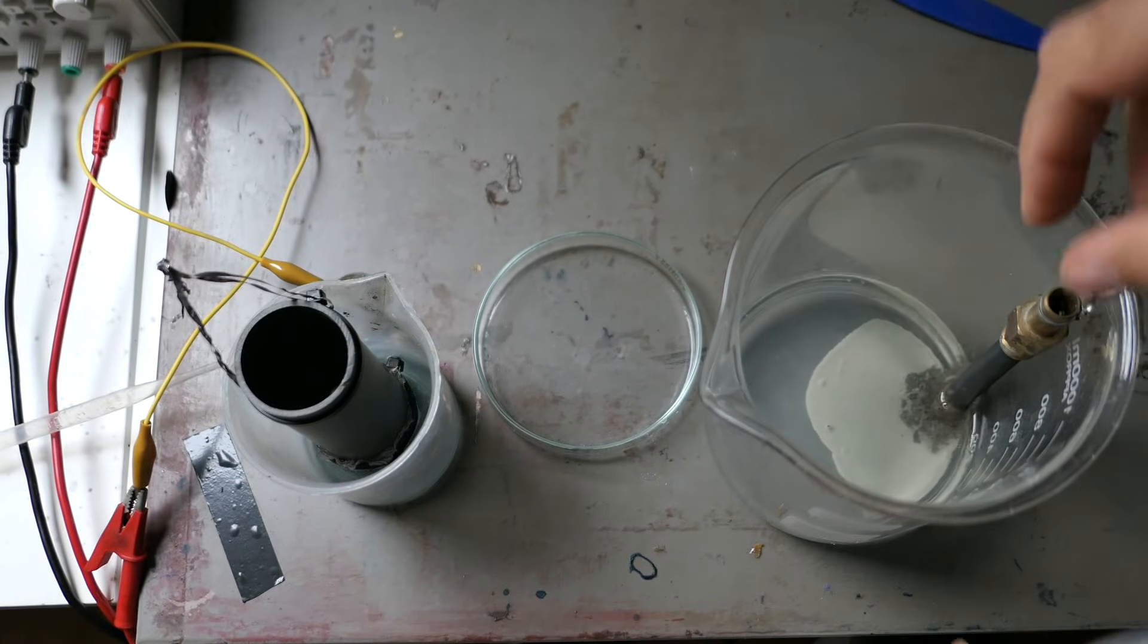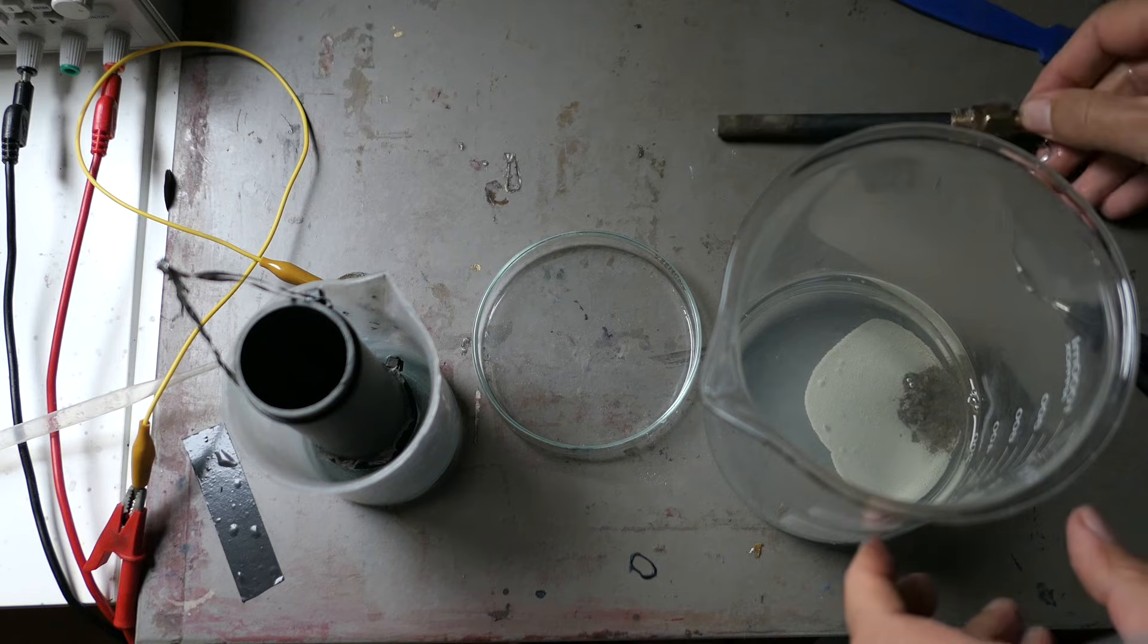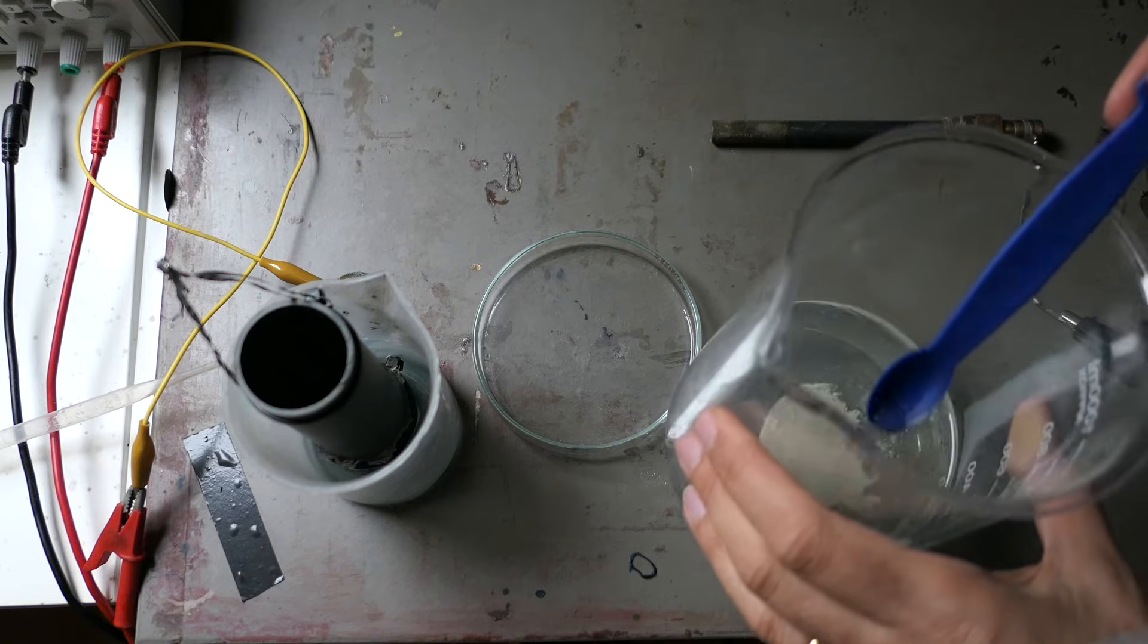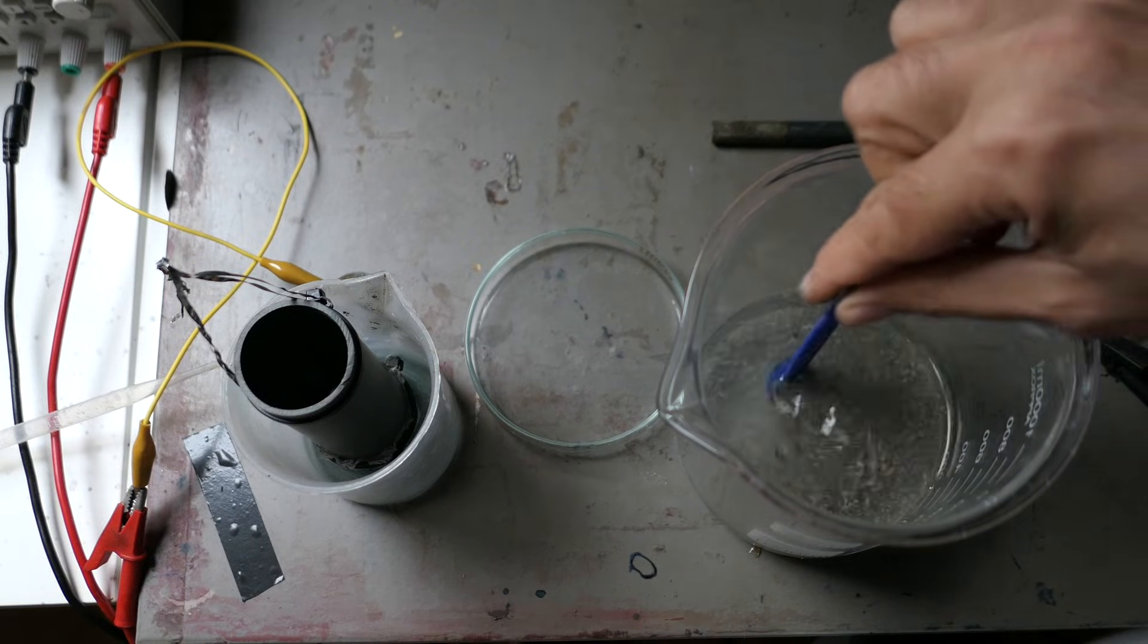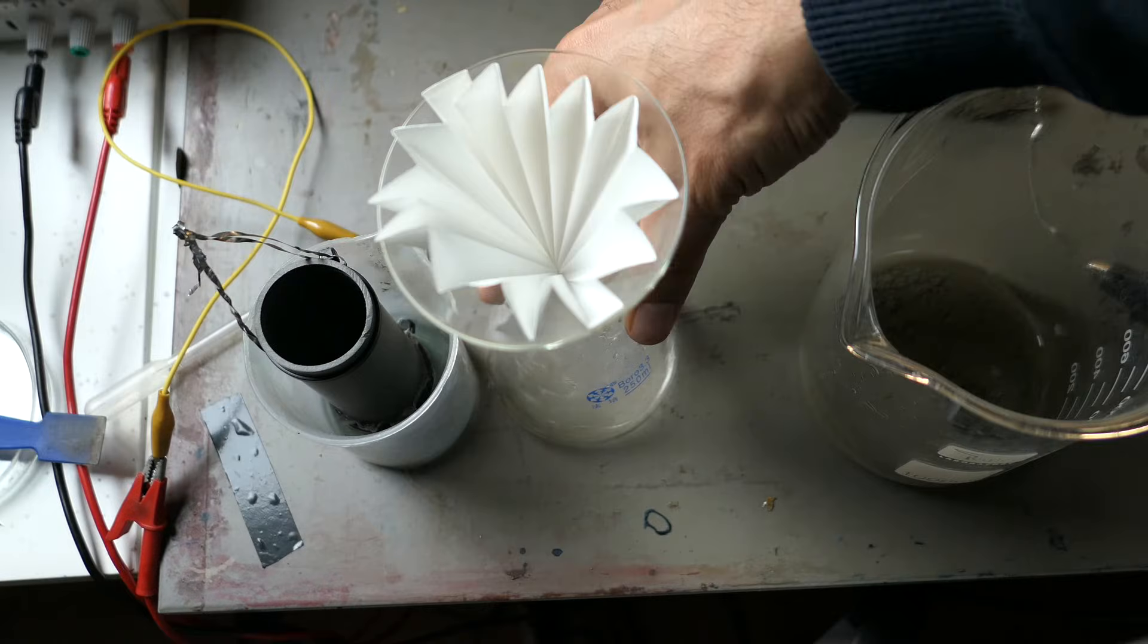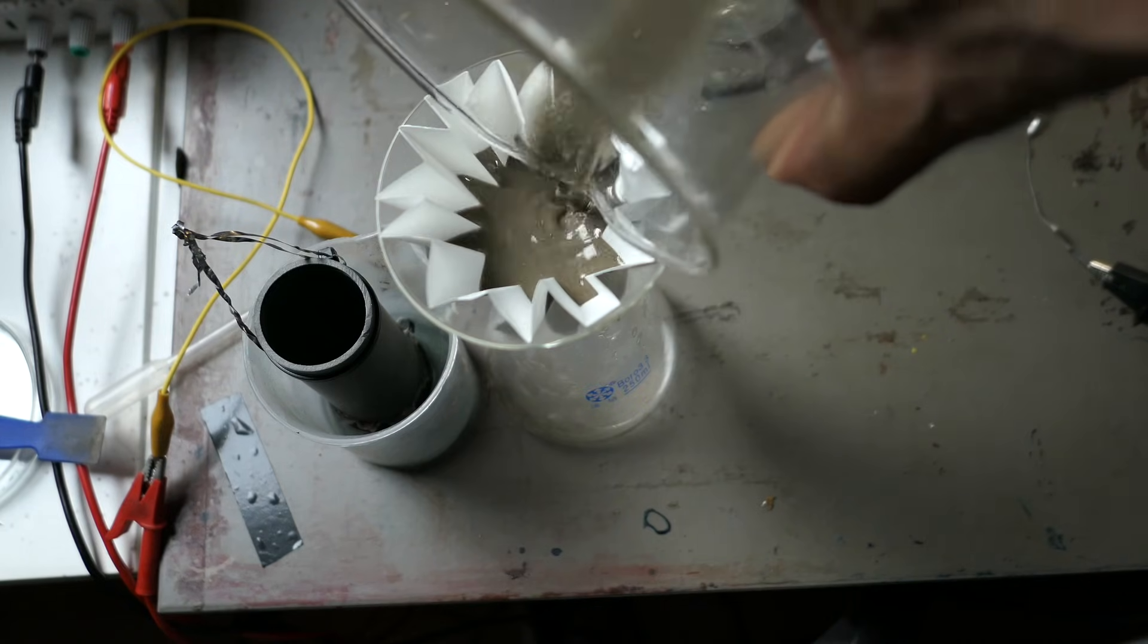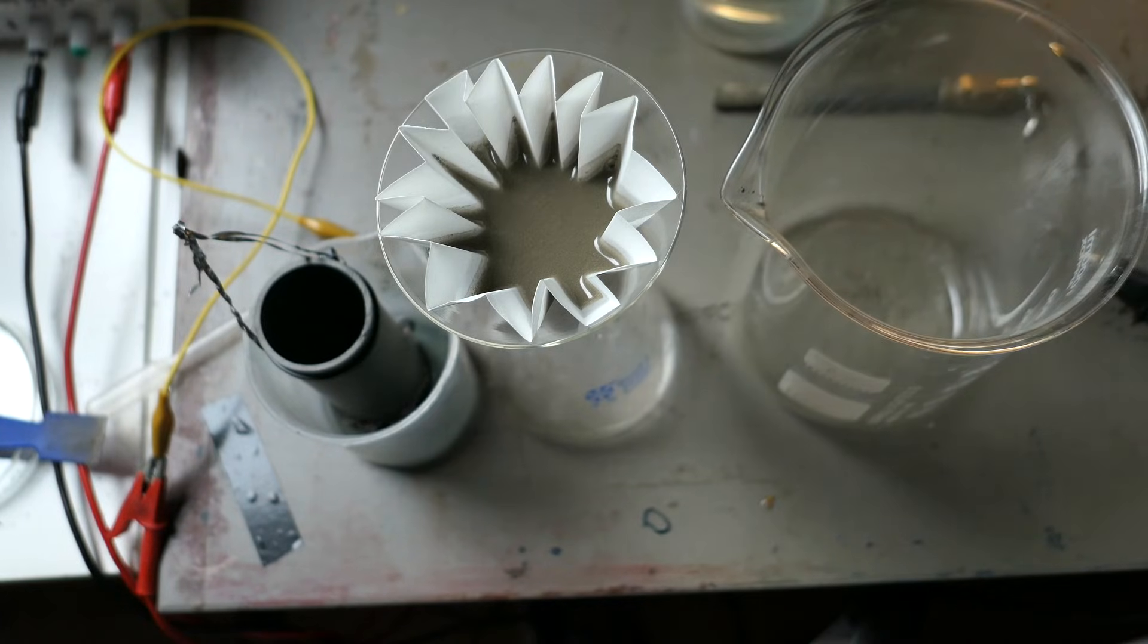Once we're done with the electrolysis, it's time to harvest the pure silver. The deposit on the cathode is collected, but before we can use it, we need to clean it up. To do that, I'm going to filter the silver deposit using a funnel and a filter paper. This step is important because we want to rinse the silver thoroughly, washing away any remaining traces of sulfamic acid or other salts that may have formed during the process. After rinsing the silver several times to ensure it's clean, we can let it dry. Once dried, we're left with pure, refined silver that's ready for further use.